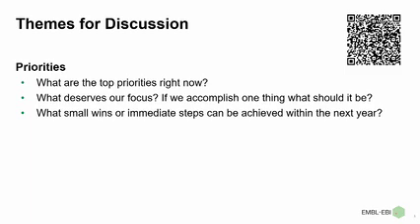If you look at how MetaboLights is doing that right now, they have the method sections in the submission part, and that's basically free text. So there's some sort of, I would say, mild agreement how to write this down, because the method sections are usually rather technical. So that's also something that could be interesting in the future, to look into trained machine learning models to actually extract this kind of information from the textual description to help with the annotation. But that's something that we are actually currently working on.